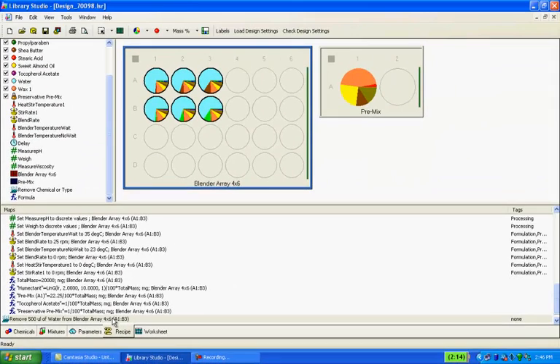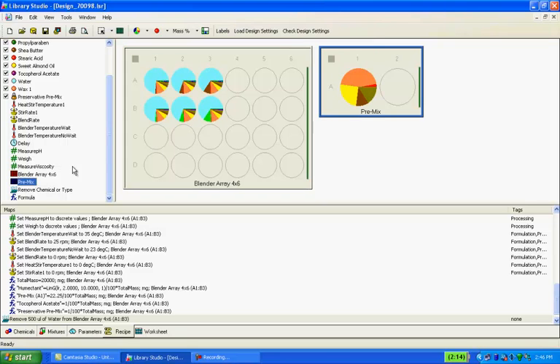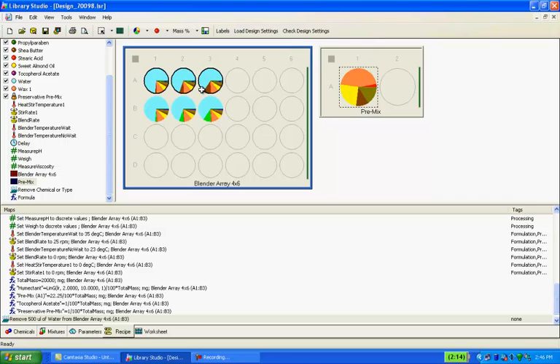There is one more feature in the Library Studio which allows you to map dispensers from one library to another. So for example, I can choose the icon, say the library premix, and choose the source position, and then I can choose the destination cells.